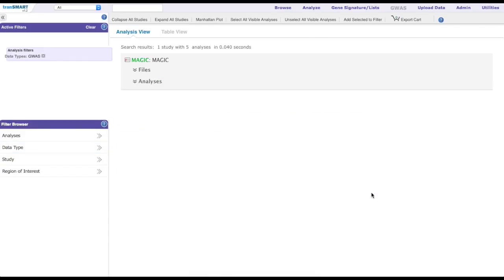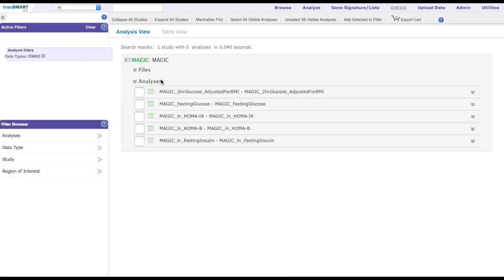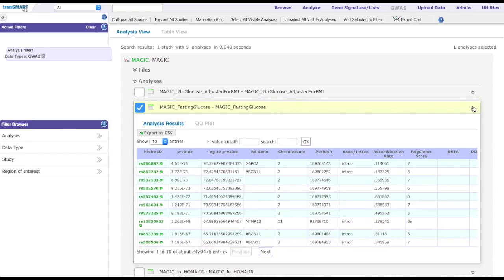When expanding a study, for example MAGIC, the analyses are displayed. Clicking on a specific analysis, for example MAGIC fasting glucose, the analysis results are displayed in a table format with the most significant SNPs including information such as probe ID, p-value, gene name, and chromosomal position.